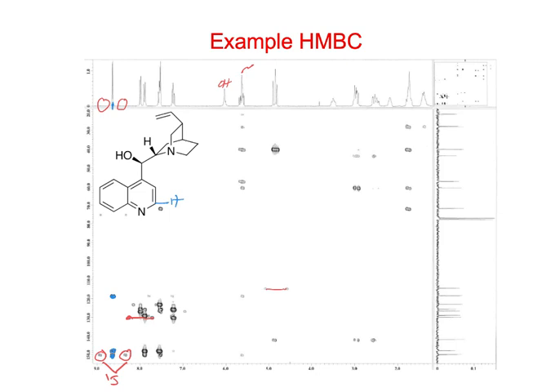And notice if we look at all of these peaks that are kind of lined up with these two, some of them are kind of wide and some are narrow, right? So just by the shape of those, this wider one goes to the double bond proton because it has a lot more coupling here. And that CH next to the alcohol is much narrower. So we can pick out the narrow ones.